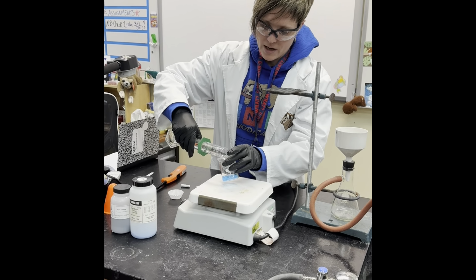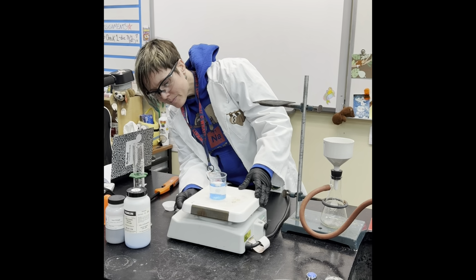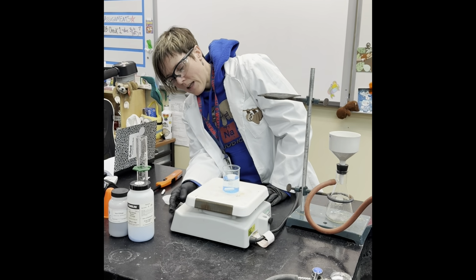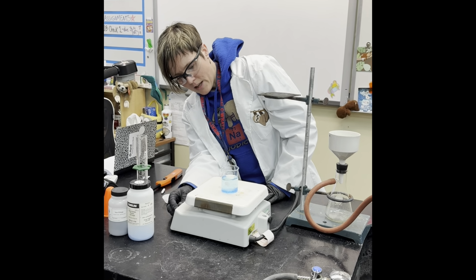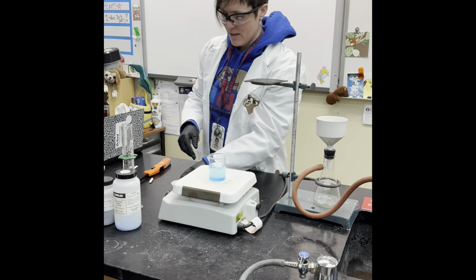So I'm going to dissolve that in here. I'm going to turn on my hot plate. Okay, I'm going to add my stir bar because, you know, that's more fun than a glass stir rod. So let that stir to dissolve. My iron filings I have weighed out in my little muffin tin.